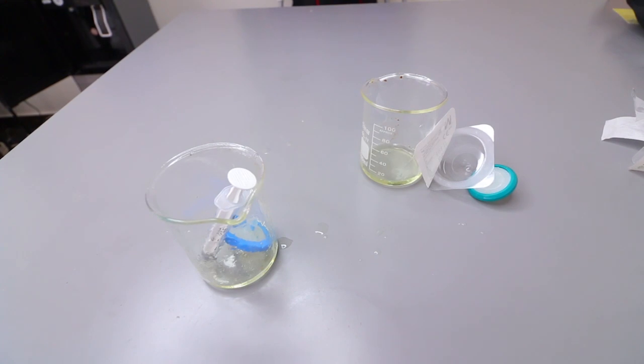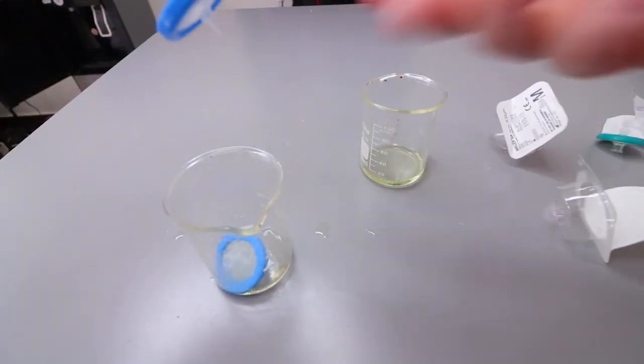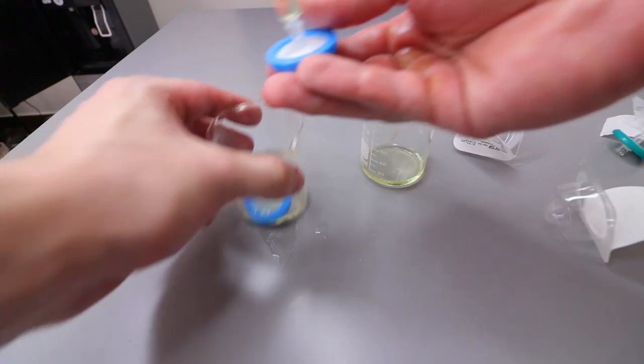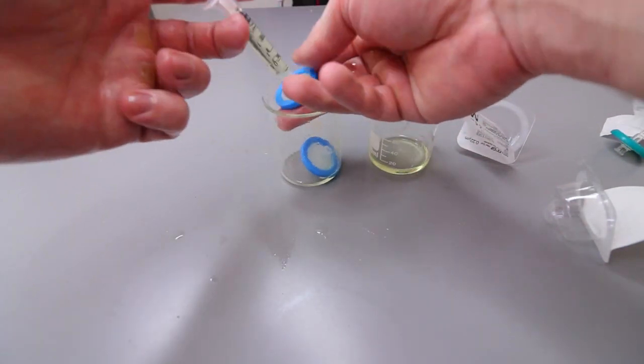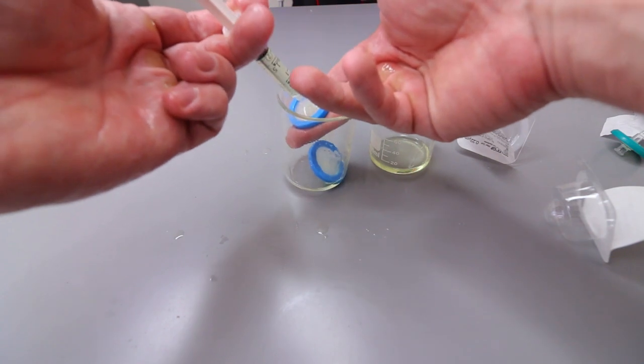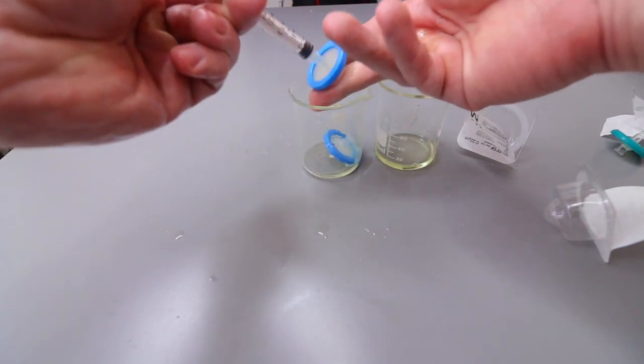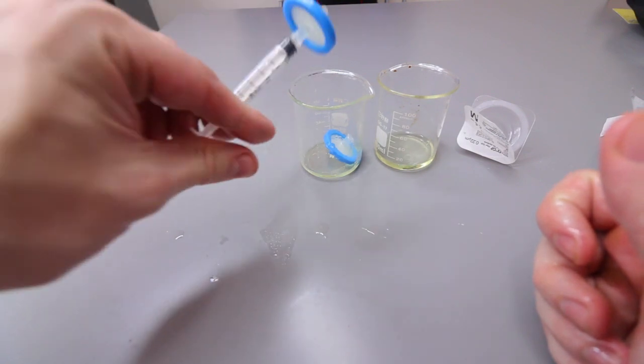I'm just going to grab one more just so you can see again. Once again I'm going to try and see if I can do this for you guys. Making a bit of a mess here but if I'm holding it there, watch how fast this gear goes through the filter. See that, all gone. And that's because the filter has broken.